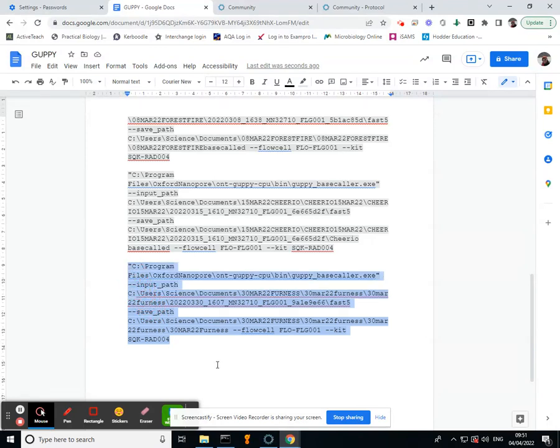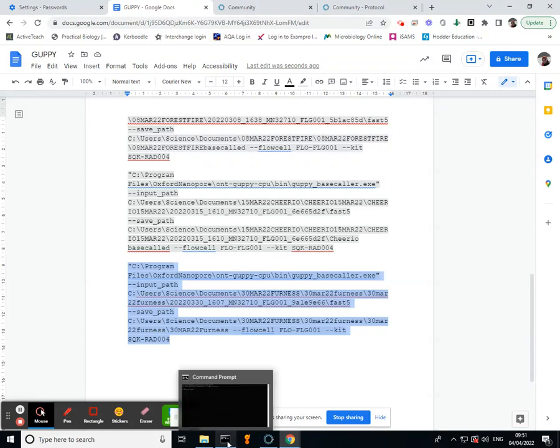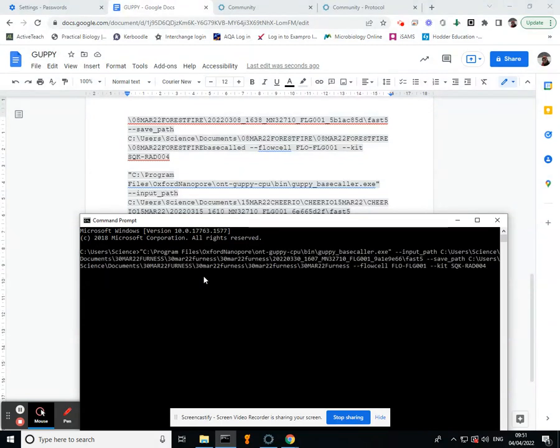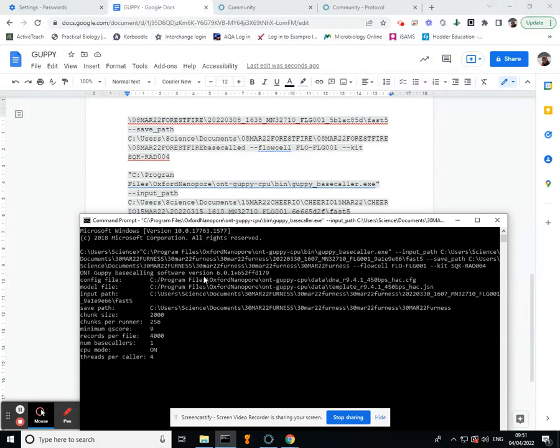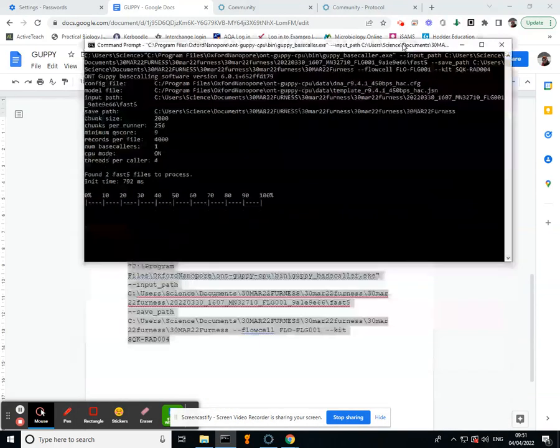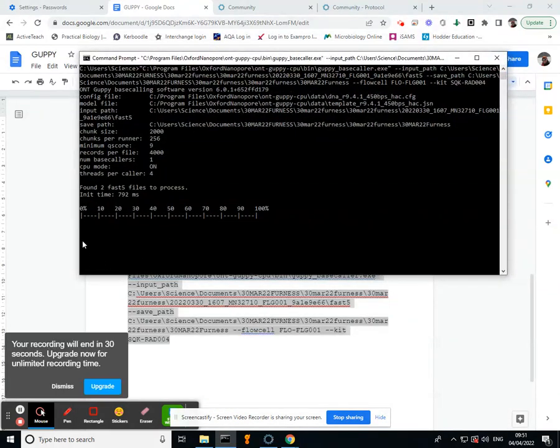So I go into this Command Prompt, which you can find in your Start menu. Hit that and then hit Enter, and you should end up with this.